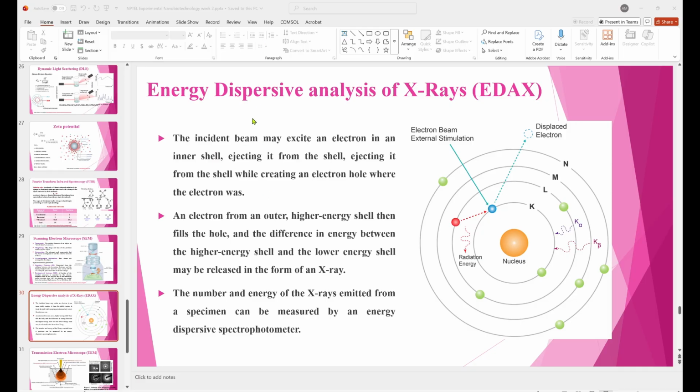But if the electron beam passes through, okay, those are transmitted electrons. So if the beam passes through, then they are transmitted electrons. They give you morphological information. So SEM gives you a 3D image, whereas TEM gives you a 2D image. Okay, then you have inelastic scattering, which gives you composition and bond states. You have elastic scattering, which gives you structural analysis and HR imaging. And then you have incoherent elastic scattering.